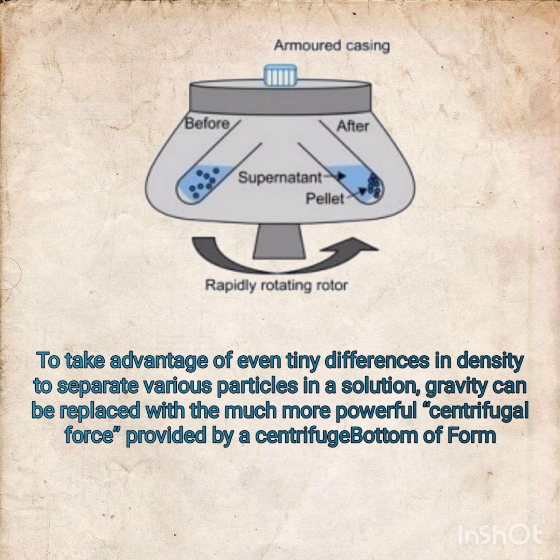If you want to clear out any type of solution and clean out all the debris, all the suspended particles from that solution, you have to perform the centrifugation technique by the use of the centrifuge. The centrifuge works by applying centrifugal force on the particles of the solution by spinning the rotor at a definite speed, which creates the centrifugal force. And due to that centrifugal force, the particles are separated out from the solution either by sinking at the bottom or by floating at the top of the solution.